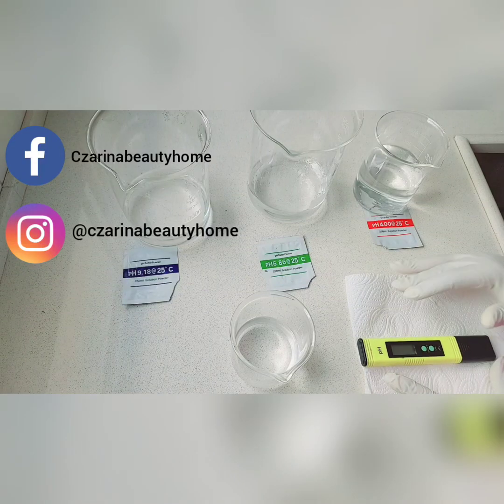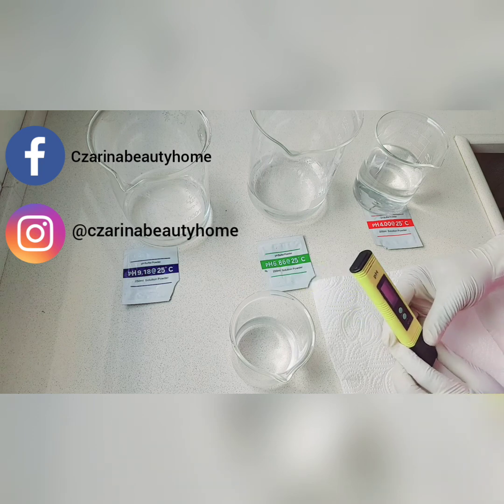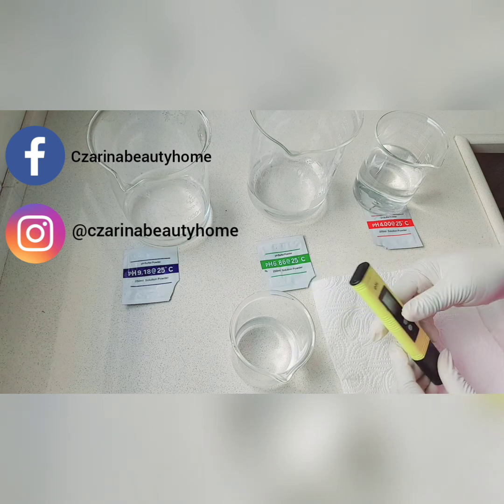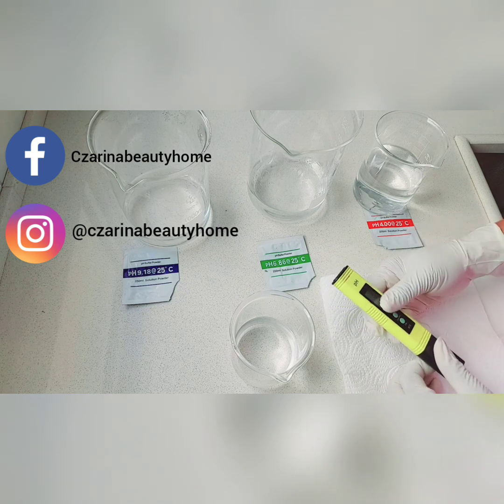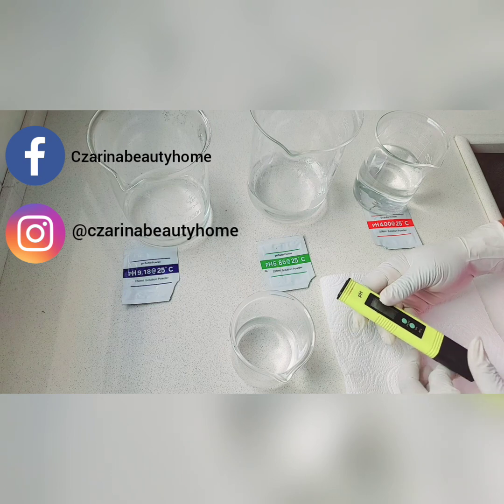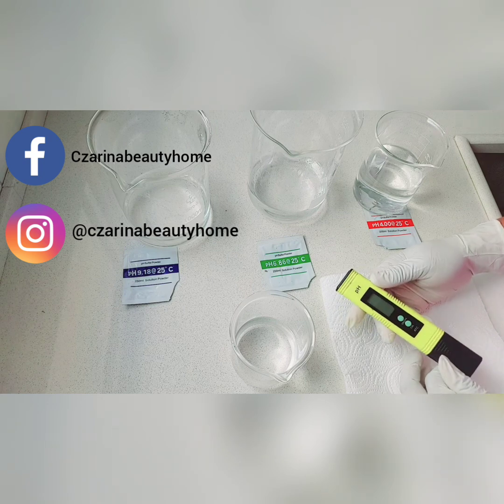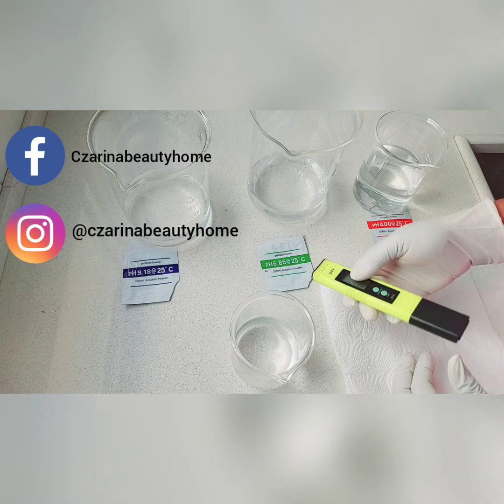I'm going to show you how to calibrate your pH meter. I have tons of requests — so many people have difficulties with this particular pH meter. They say this pH meter is so useless: it doesn't read, it doesn't do this, it doesn't do that. The question is, how long do you wait to calibrate your pH meter? So many of you believe that you calibrate your pH meter once and that's it. That's a huge lie.